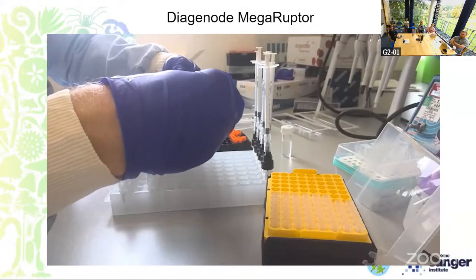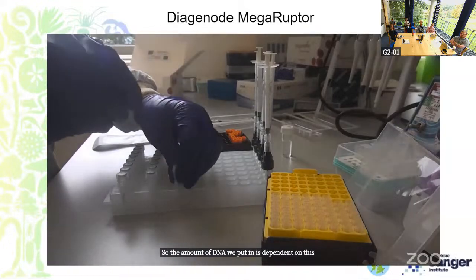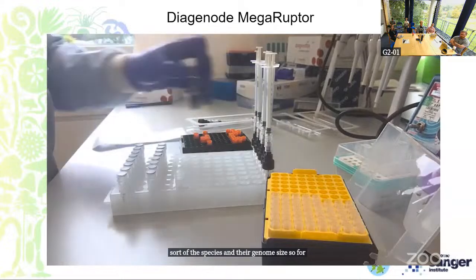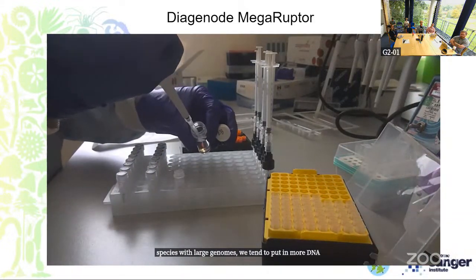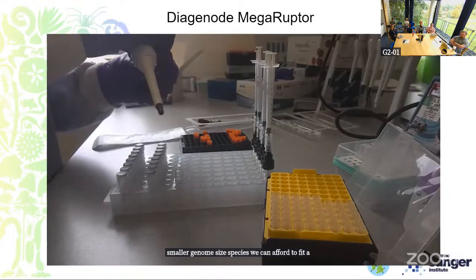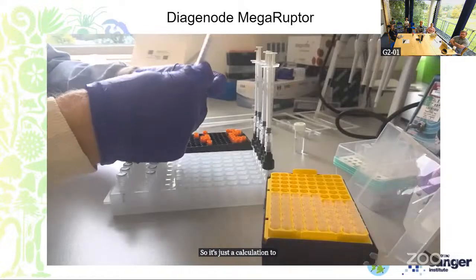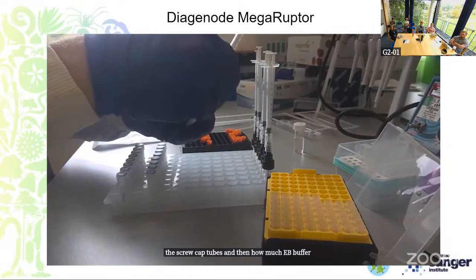So the amount of DNA we put in is dependent on the species and their genome size. For species with large genomes, we tend to put in more DNA, while for smaller genome size species, we can afford to put less in. So it's just a calculation to determine how much DNA goes into the screw cap tubes, and then how much EB buffer needs to be added.